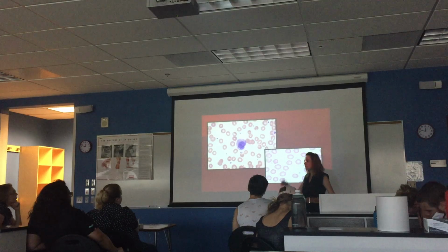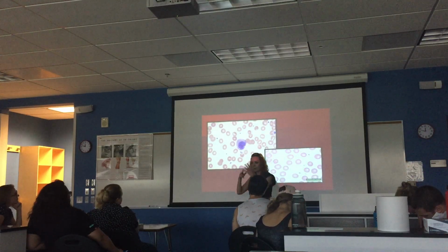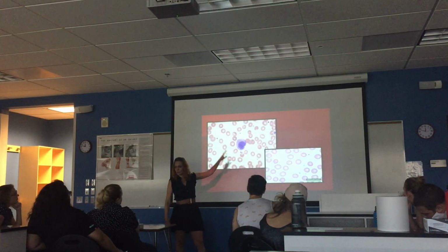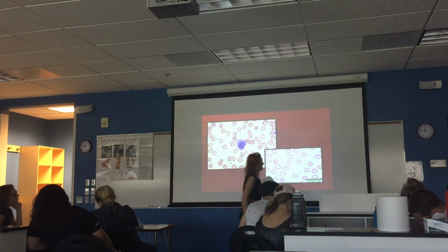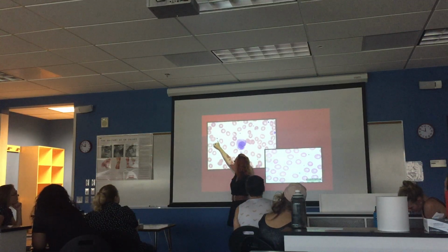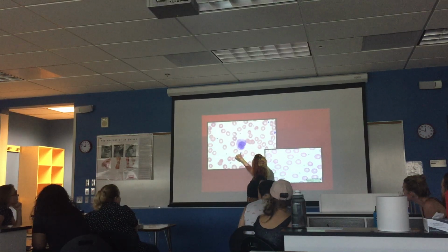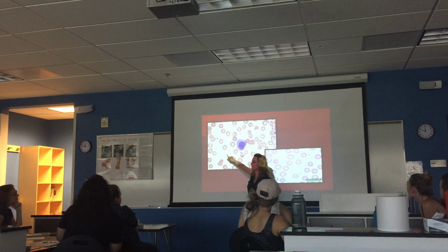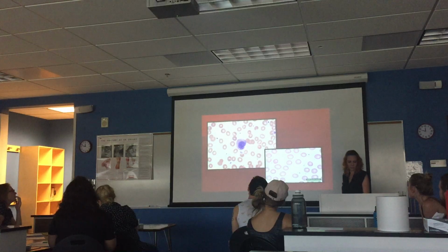Blood, again, this is an A&P 2 topic. You'll get to play and name all the white blood cells and count them and whatever. So for now, identify this tissue as connective tissue, blood, support. Just for fun, what do you think these little flecks of randomness are? Nope. Nope. Platelets. White blood cell, red blood cell, platelet. Plasma. Yep.